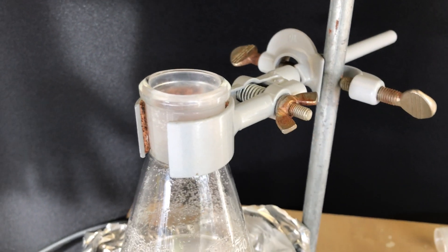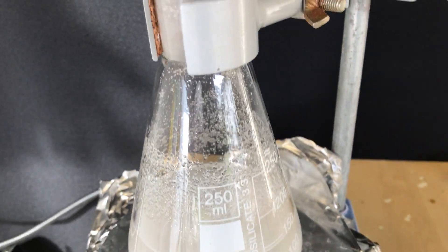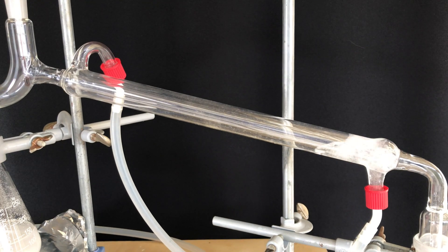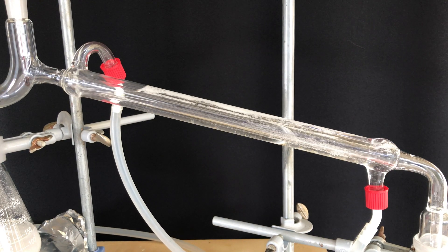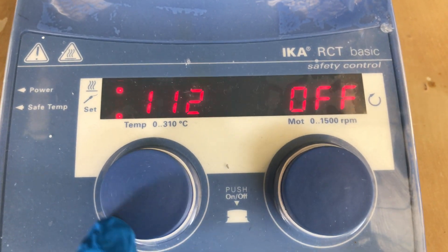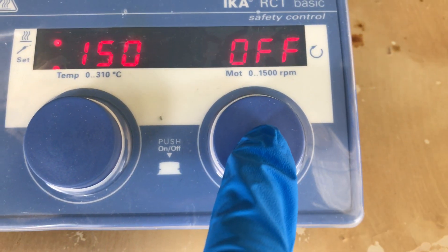A hot plate was set up and we added the most important ingredient for this reaction, a stir bar. I continued by setting up a simple distillation and then flushed the distillation bridge with water. Heating and stirring were turned on and I set the hot plate to between 150 and 160 degrees Celsius.